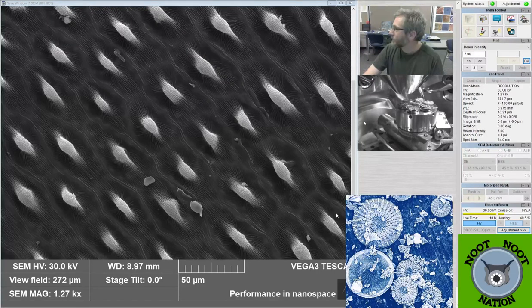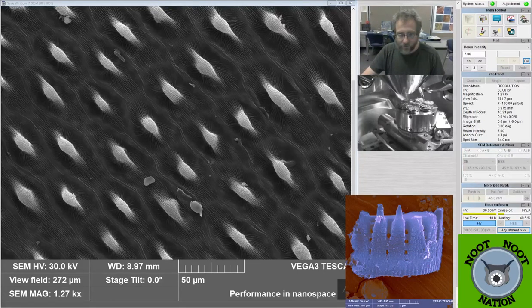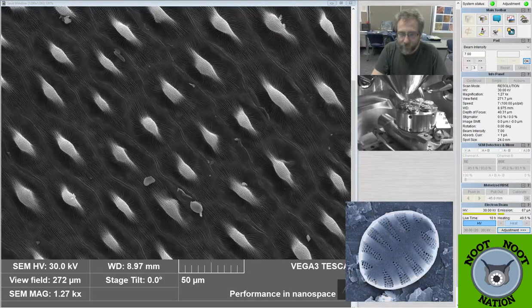Okay, we are looking at plant material. This one is Flox, which is this little light purpley pink colored flower with a yellow center. And the yellow is where the pollen is. So the pollen and these are actually yellow, I think. And this is just the leaf of the flower. Flox petal.